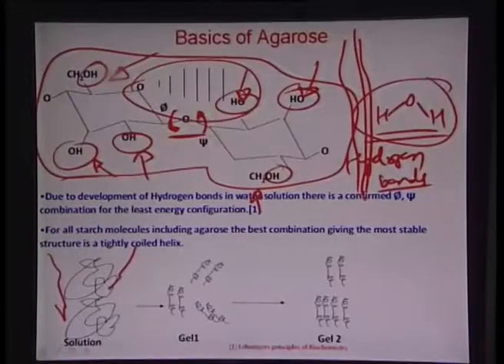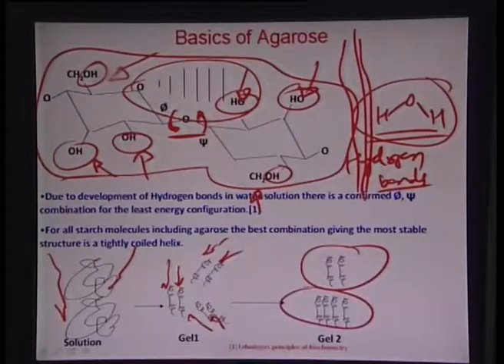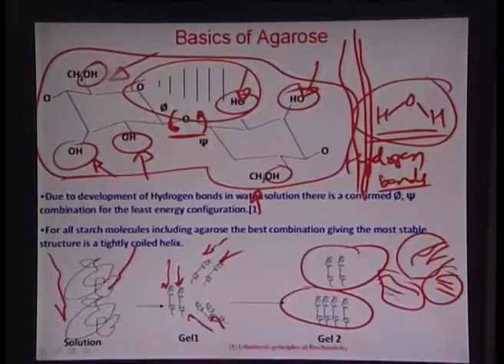There is a solution in which you have put these agarose molecules, and they have started forming this coil-like framework in the presence of water, especially when they get molten, and then they can get some organization, or they can actually start nucleating at various centers, and that is how they can get a randomized porous nature all through the surface.